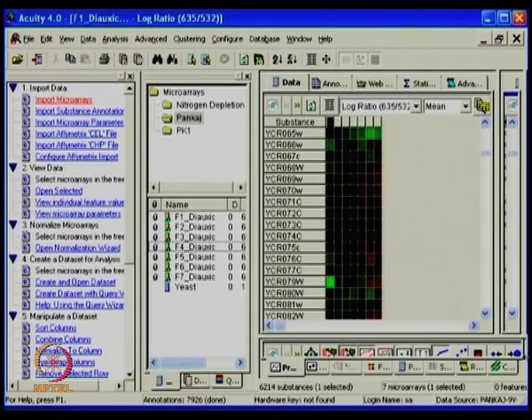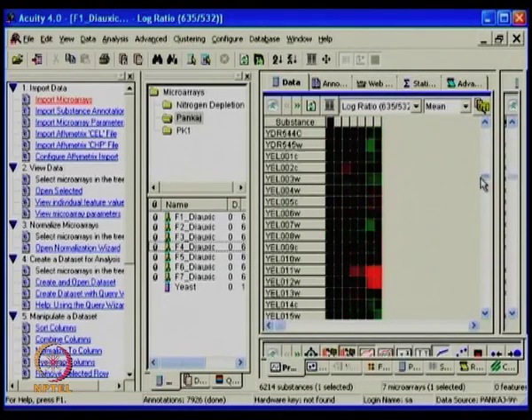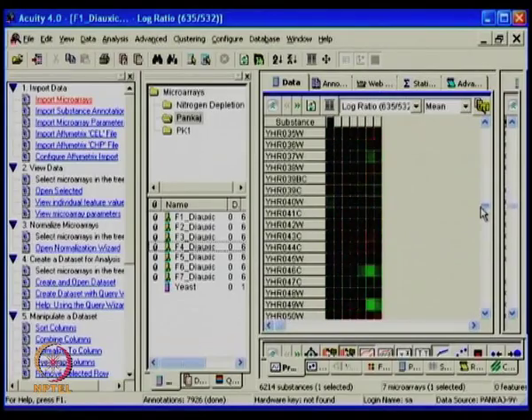True. And so by looking at this type of data, one can visually get a feel about the expression changes across the different time points. Very true. So this gives you an immediate visualization tool to understand what is happening and get a rough idea. And this is, mind you, just the raw data. We have not performed the normalization, and we are just seeing how they are behaving. So it gives you a rough profile.